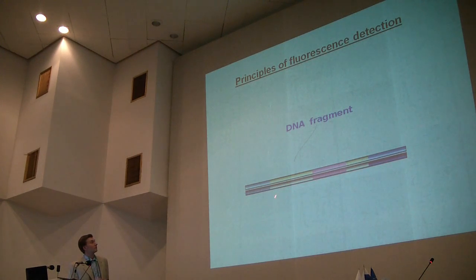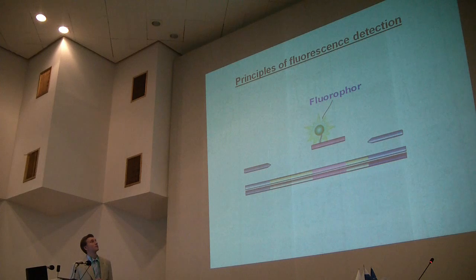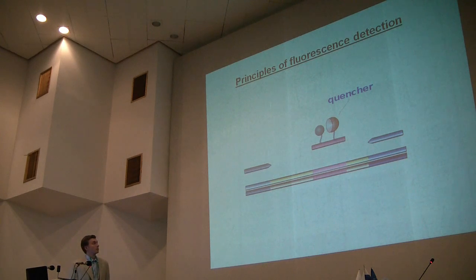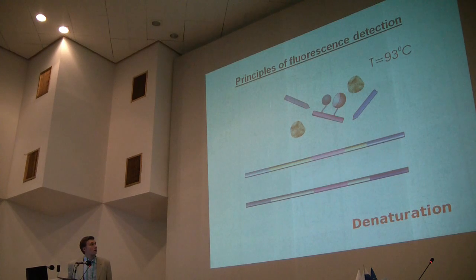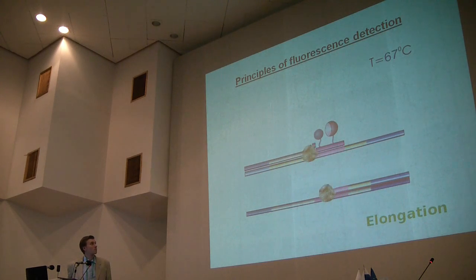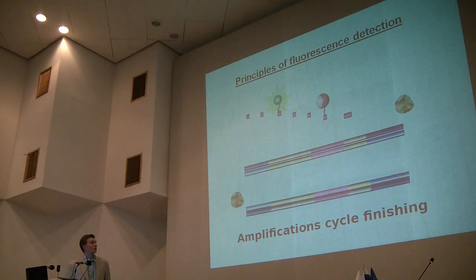Specific DNA fragments, specific sites for primers, probe with fluorophore and quencher, and the probe. Subsequent steps of PCR, and amplification cycle finishing.